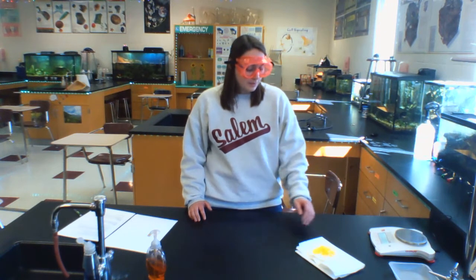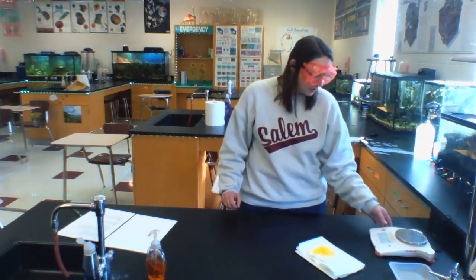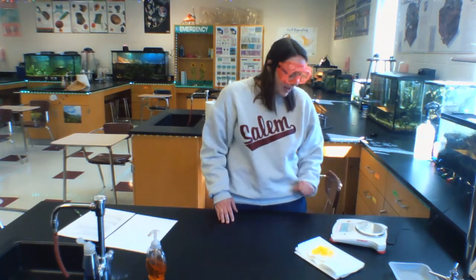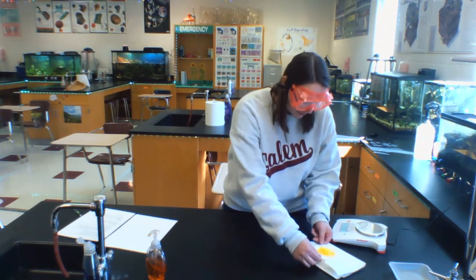So we're going to be able to use that information today when we find the mass of the filter paper plus the product, to then do a subtraction problem and find the mass of our product. So I'm going to go ahead and do that. I have my electronic balance here. It is zeroed, and that means that I'm ready to put my product on the electronic balance to find out the mass of this filter paper plus the product that has dried on it.